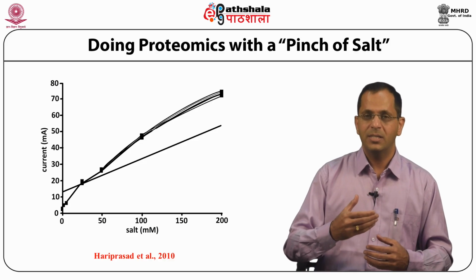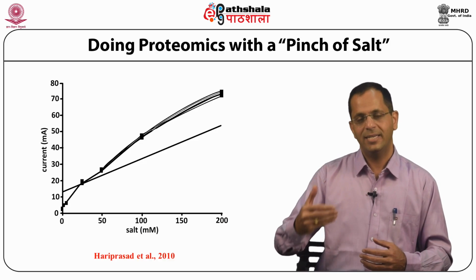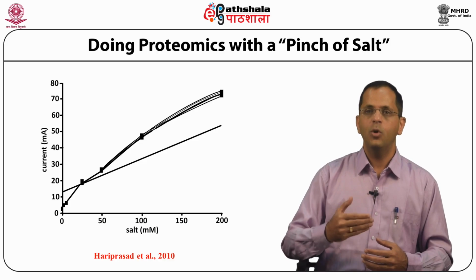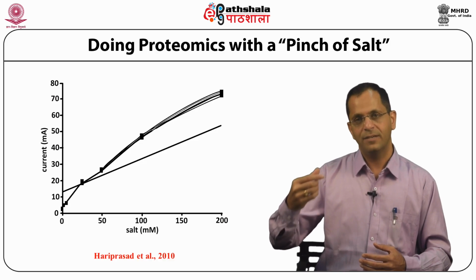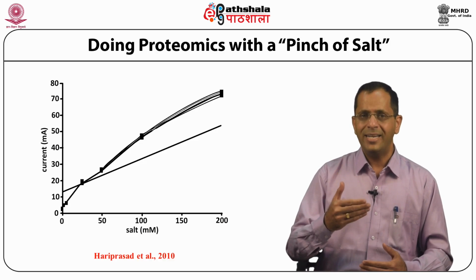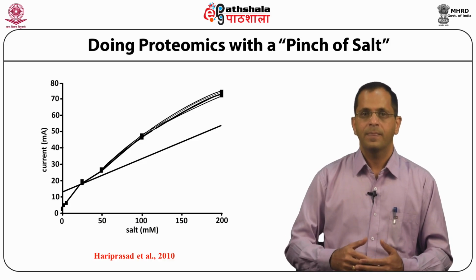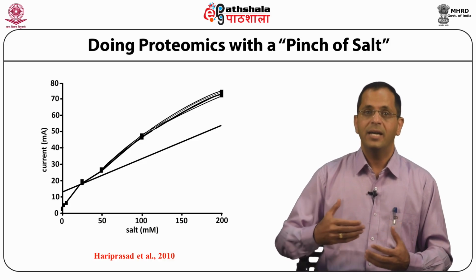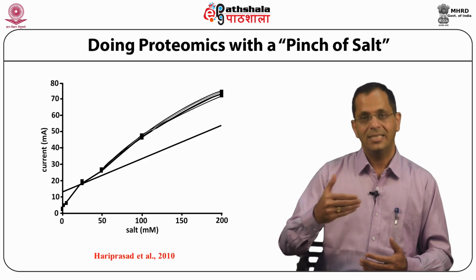Therefore, the salt concentration can be determined by the extent of conductivity of electricity by that particular sample. As you see in the graph, the more the ionic impurities, the more the conductivity, which reflects on the quality of the sample. The advantages of knowing salt contamination are enormous because of the precious nature and paucity of the clinical samples. A lot of effort and time goes into procuring and processing these samples.